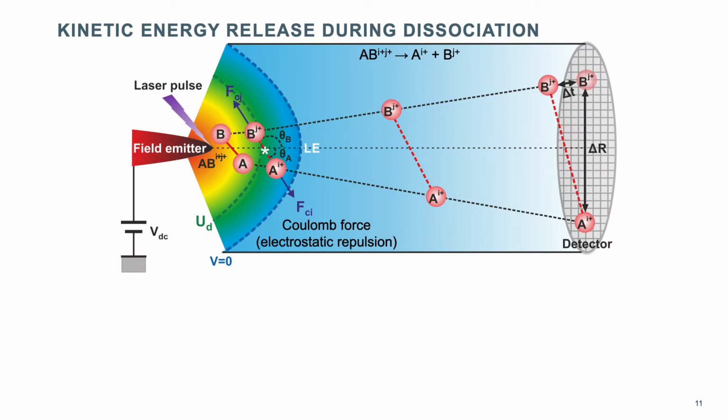Another reason that can produce multiple hits is when a molecular ion gets emitted following, for example, one single laser pulse. This molecular ion is typically metastable, and under the influence of the intense electric field, plus the fact that it's metastable, these molecular ions can just dissociate. And this will mean that for one ion that was emitted, multiple ions will strike the detector. Some of them might get lost, but often both of them will get detected.